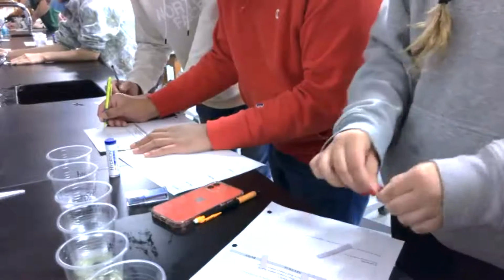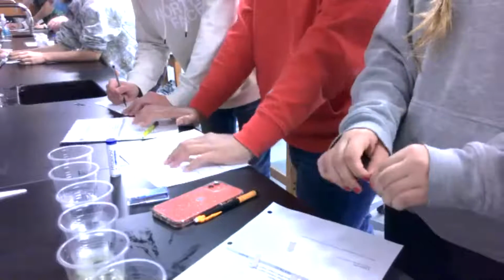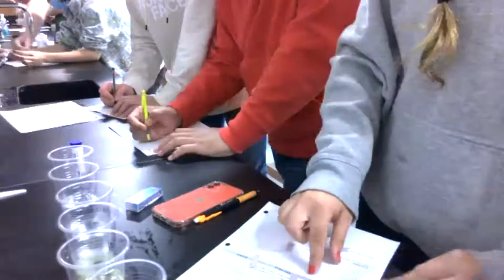Acids turn blue to red, bases turn red to blue. So these are all acids. So we gotta do on this. Do I just do it? Oh, okay. Wait, what do I do now? You put it on the paper and the spot that it goes. What did I just do? Where's my thing? Oh, I dropped it in there. It's still in there. So more. What color is it?